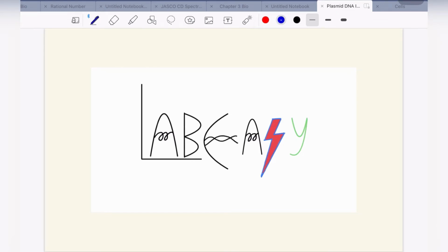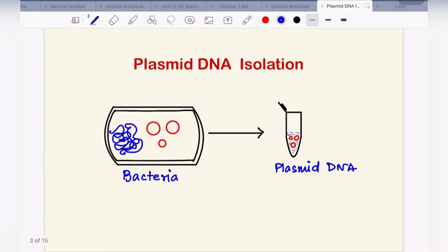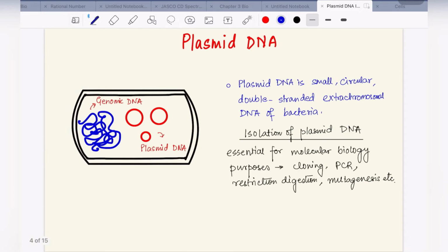In today's video, we will be discussing a very fundamental molecular biology technique, that is isolation of plasmid DNA. Now we know that plasmid DNA are small circular double-stranded DNA molecules which are extra chromosomal DNA of bacteria, and they are capable of independent replication.